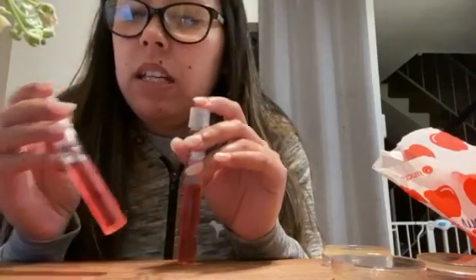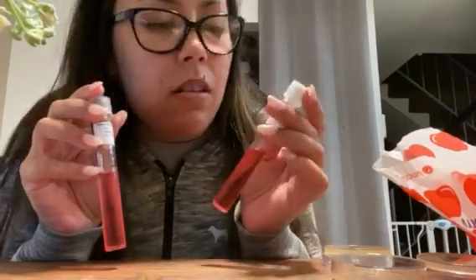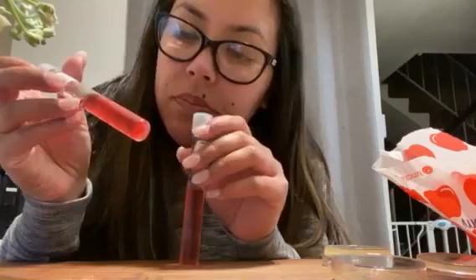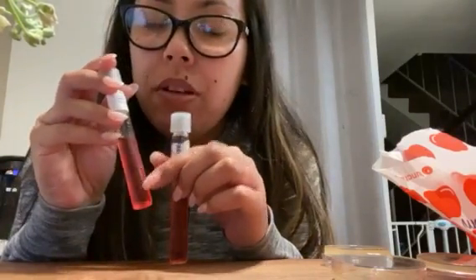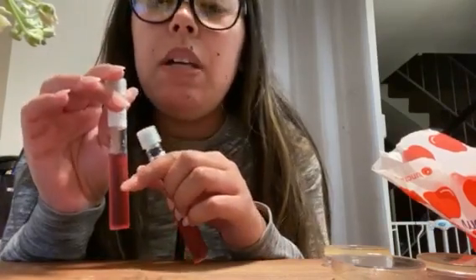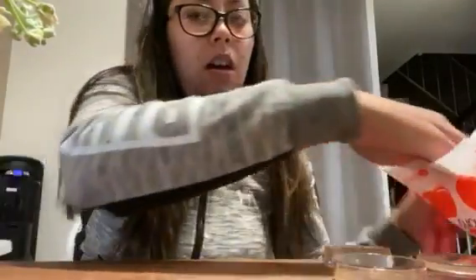I think that the E. coli one was a little bit more dominant than the epidermidis one. You can still see there were some floating particles, and it also had the cloudiness located at the bottom, but the top portion was still clear.